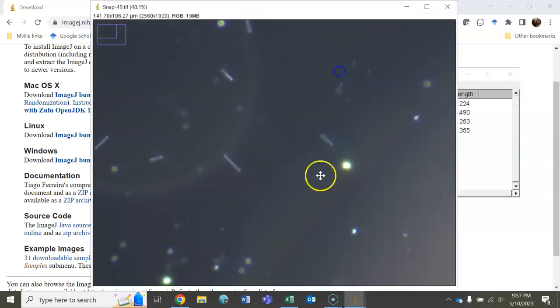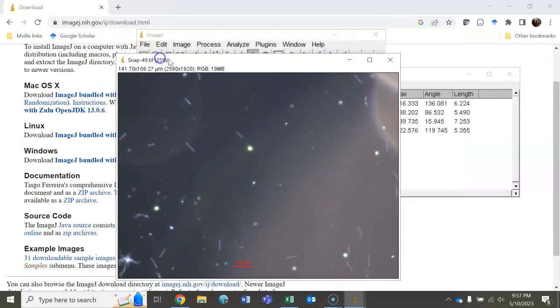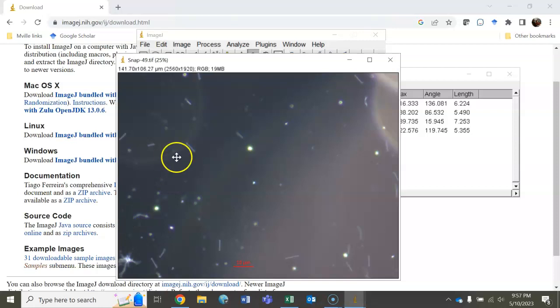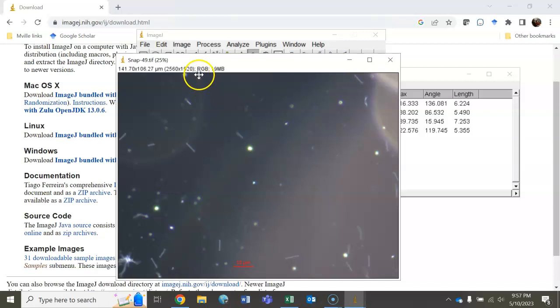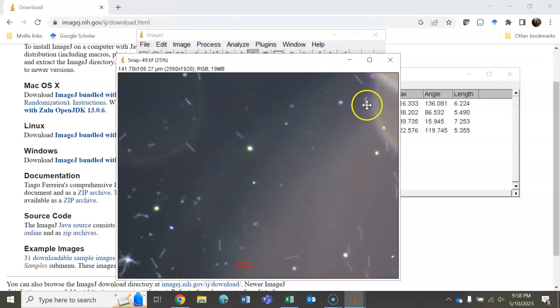Let's see if we can make it bigger and capture every single cell you see in your image that can be captured. If something is out of focus, or up here at the top, we can see this spirochete is not fully in the frame, it's actually falling out of the frame. In this case, we wouldn't want to capture that one because it's not in the frame, so we might be missing some of the length of that spirochete or cell. Over here on the edge, I'd also probably avoid these two.